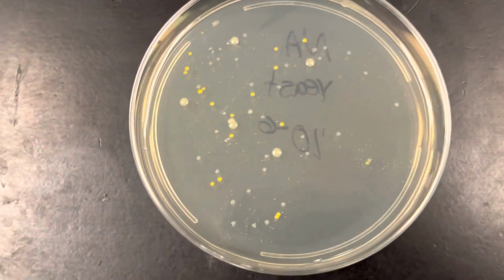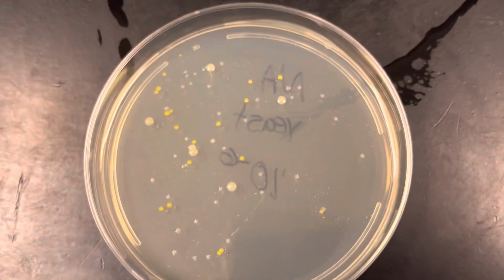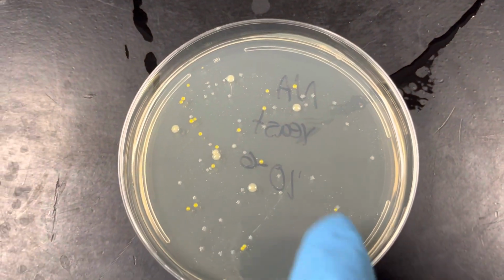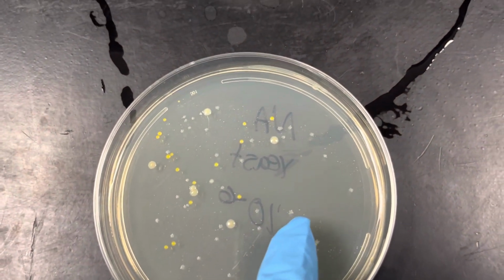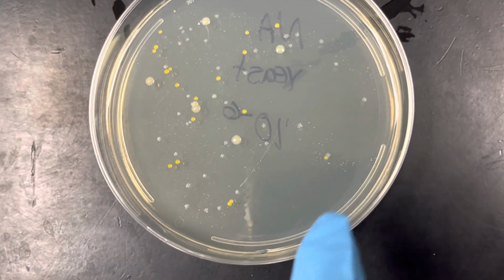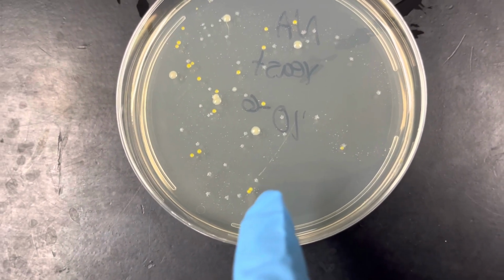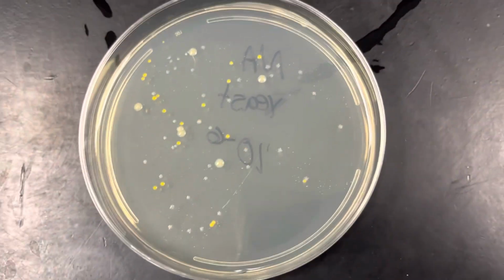And then the last one, they're so scattered that, again, hopefully now you feel like you can tell the difference between the yeast. So yeast, that one would be yeast, that one would be yeast. That would be a bacteria. It's too yellow, although it's kind of on top of a yeast, so there's kind of two together. So you would count the yeast, but not the yellow for the bacteria. Two bacteria are yellow, a yeast, yeast, yeast on either side.